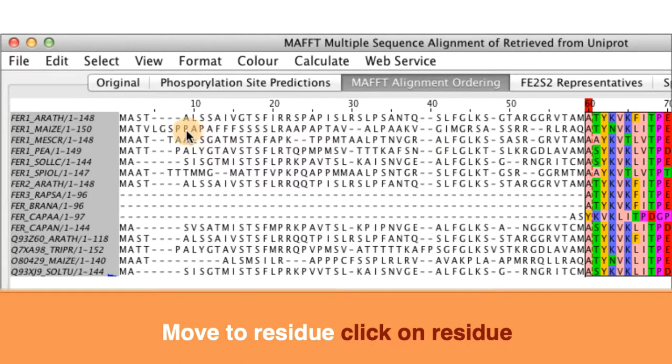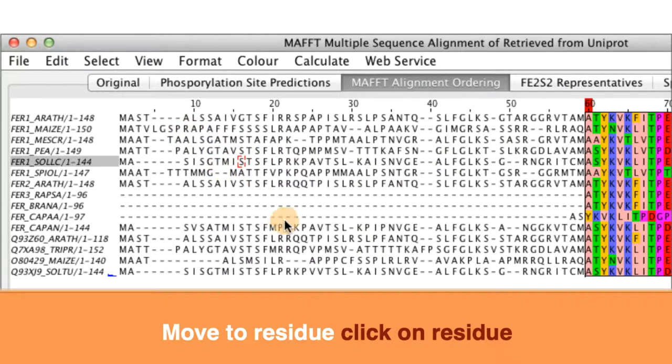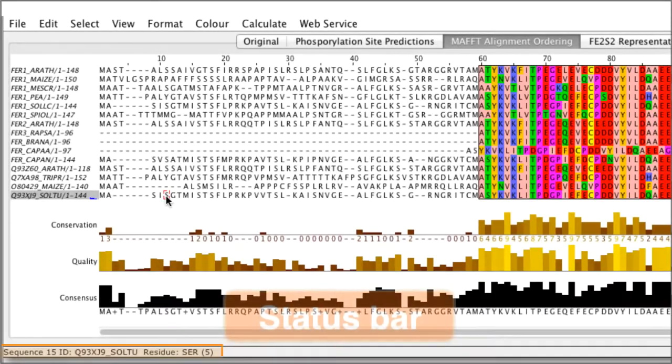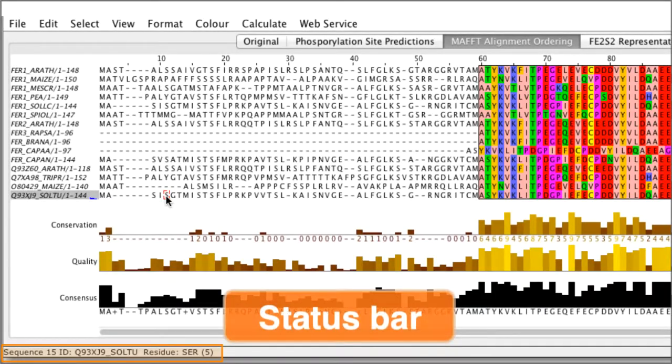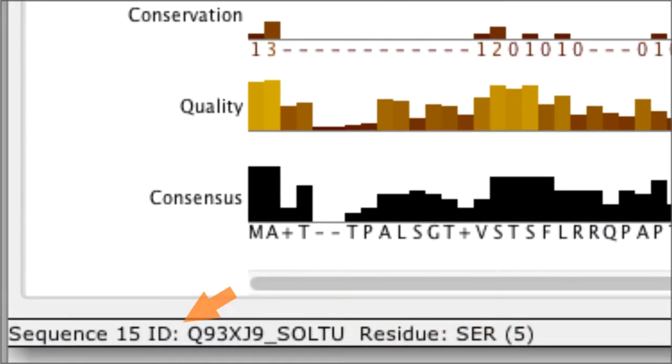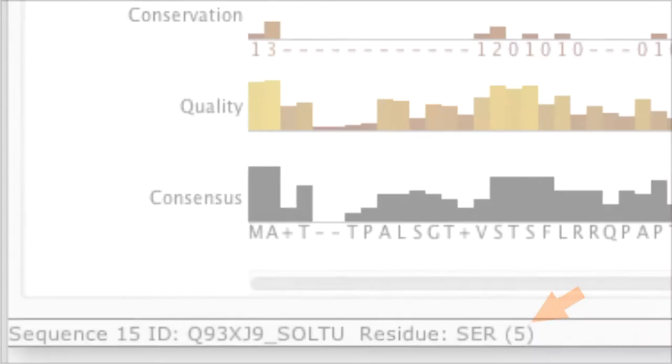To specify a specific residue move the cursor to the residue of interest. Take note of the information that is shown in the status bar. This tells you the sequence ID and the name of the residue that the cursor is located.